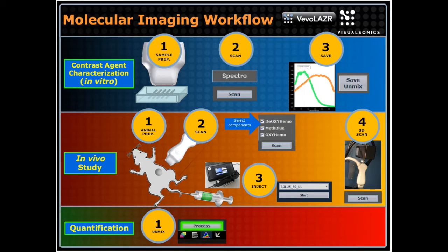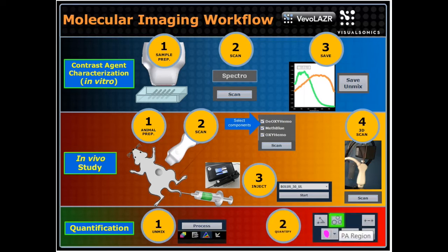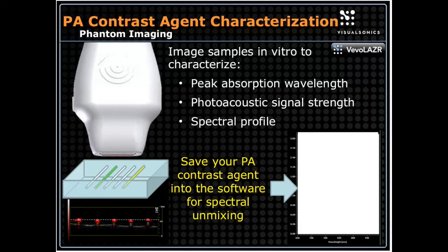As far as the quantification goes, once we've acquired our 3D volumes at multiple time points, or even our live injection, we can then unmix the signals from the different components and quantify them as well. And I'll describe that in slightly more detail here.